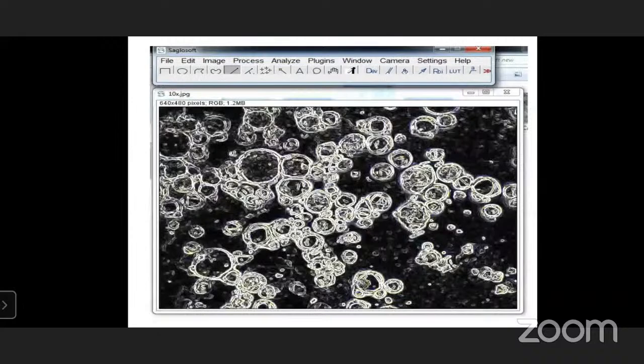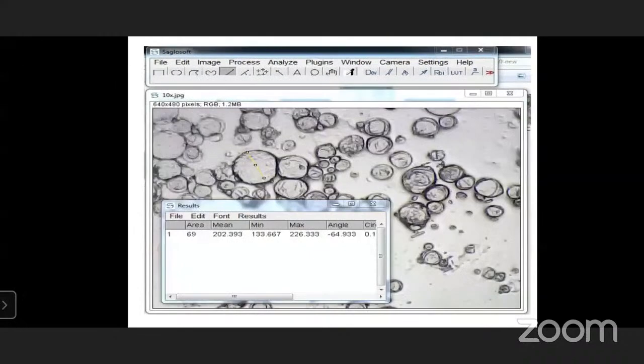Second slide आहे तो म्हणजे काय inverted phase contrast or particularly dark field microscopy. So this slide, that previous slide is converted into the microscopy. So dark field microscopy चे दोन टाइप्स येतात, म्हणजे ऍक्च्युअली दोन प्रकारे करता येते. एक तर तुम्ही डार्क फील्ड फिल्टर, यू हॅव टू यूज द डार्क फील्ड फिल्टर इनटू द मायक्रोस्कोप. अदरवाइज सॉफ्टवेअर बेस्ड डार्क फील्ड मायक्रोस्कोपी म्हणजे सॉफ्टवेअरचे इमेज प्रोसेसिंग थ्रू तुम्ही डार्क फील्ड करू शकता किंवा फिल्टर घालून. आता फिल्टर घालून जर मायक्रोस्कोपी करायचं असेल तर त्याच्यामध्ये एक ड्रॉबॅक आहे की सोर्स ऑफ लाईट अँड देअर हँडलिंग इज मोस्ट इम्पॉर्टंट.